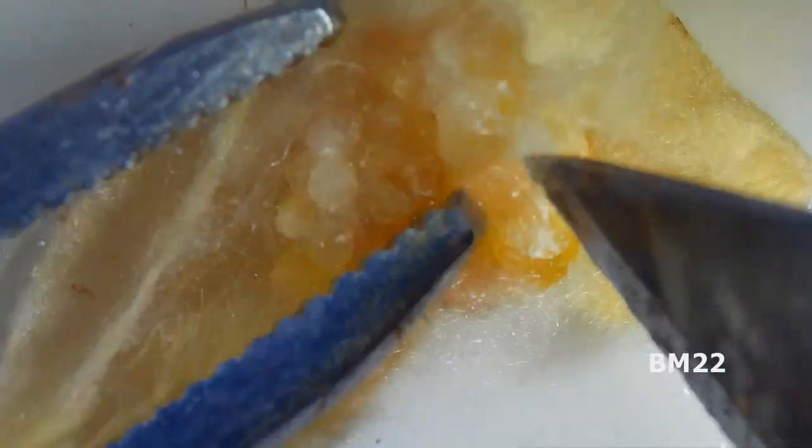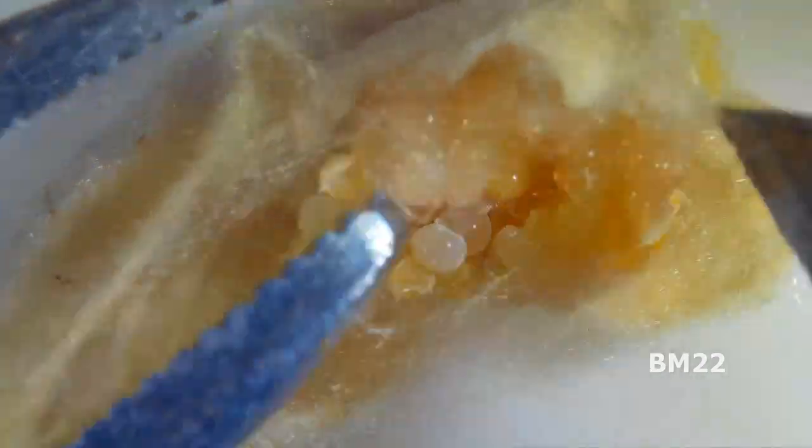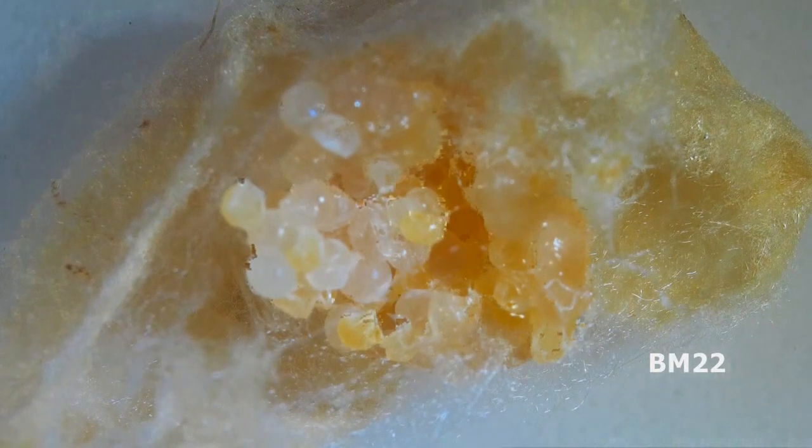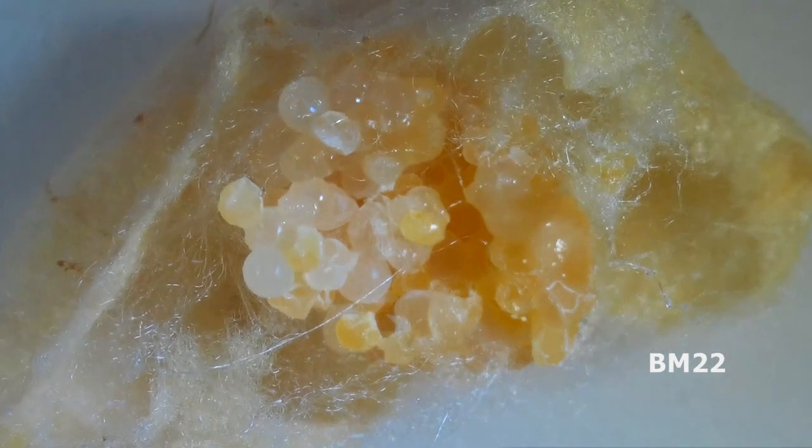Yeah, something went wrong in this egg case and I don't know if it happened during the laying or they weren't good eggs or if during storage. Maybe that's the reason why the Black Widow spider moves the egg case around because you got to keep spinning it. I don't know. Yes, it's pretty bad looking in there. But some of the eggs look like they would have hatched. I can't tell for sure. But you have some eggs that look good and some that just look horrible.